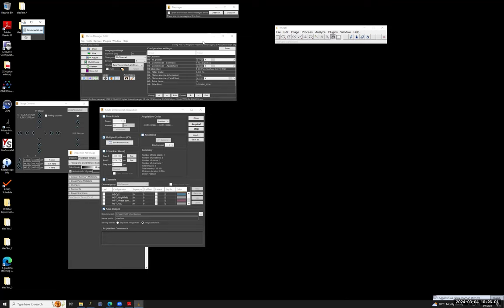And just to mention here, which I didn't mention earlier, Micromanager is primarily designed to control wide field microscopes. But it is flexible enough that it can sometimes be used to control systems for which it wasn't primarily designed. Then I can cite an example of our confocal Raman system at CEITEC, which is controlled by Micromanager. So that required a bit more creativity in using some of the features for what they were not primarily designed for. But here I'm sitting at a wide field microscope, so everything is used in the way it was intended.